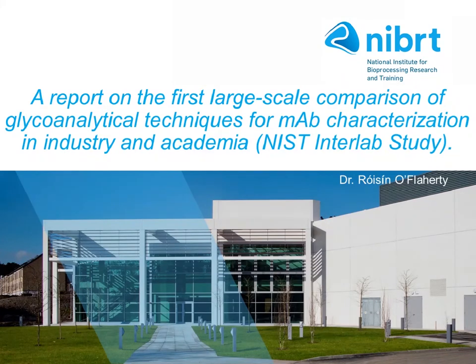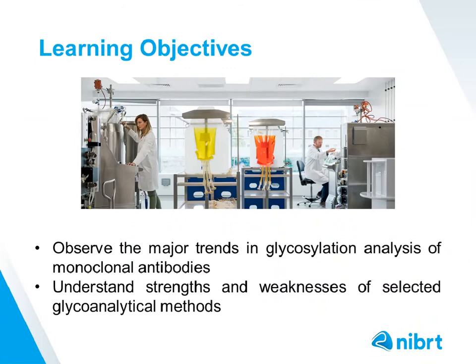So as Jim mentioned, this is a collaboration between NIST and the Medicine Maker, and today I'm going to talk globally about glycosylation in biopharmaceuticals. The study I'll talk about today was initiated by the NIST, or the National Institute for Standards and Technology, which is based in the US. It's a large-scale interlab study conducted across industry and academia to assess all the different types of glycoanalytical techniques for monoclonal antibody characterization.